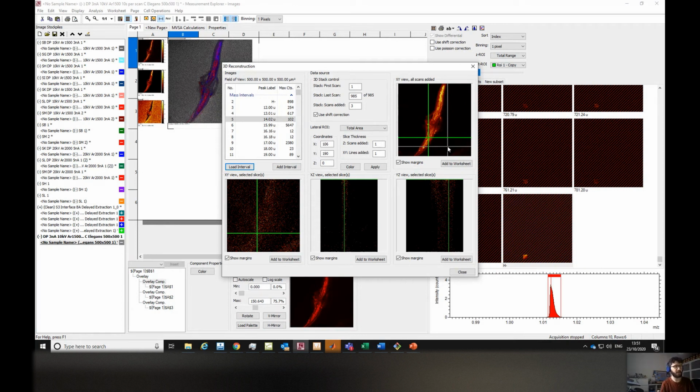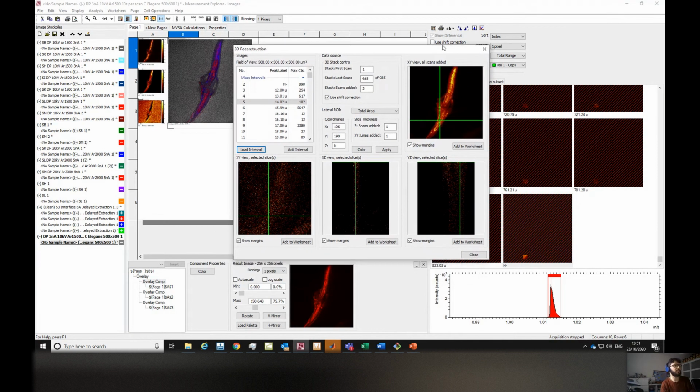Then it's a kind of 3D version of the Orbi. It's not automatically structured as far as I know, because here it's dual beam, right? One beam is just imaging and acquiring data, the other beam is etching. With Orbi, most of the time we use a single beam to acquire and etch the material. So with the TOF, it's always 3D.